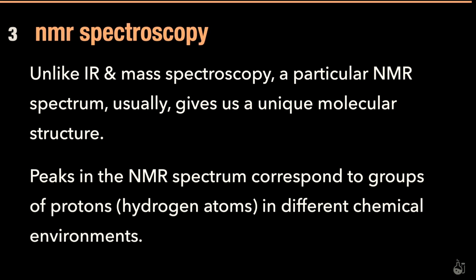And for that there are two types of NMR spectroscopy we'll be doing: proton NMR and carbon-13 NMR. We will start with proton NMR and then do carbon-13. Proton NMR is much more detailed and also much more useful, and you can get most stuff from it. Generally, carbon-13 NMR only tells me the functional groups of the compound. For the first 2 days, we'll be looking at proton NMRs.